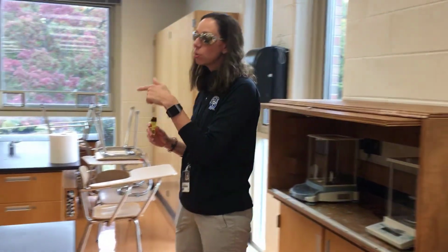So we're going to do this 2 more times and give you the data for those other 2 trials. So you'll go through the calculations. You'll get 3 molar masses, 3 gas constants R, and then you'll be able to get your average, but you'll also be able to look at error analysis.